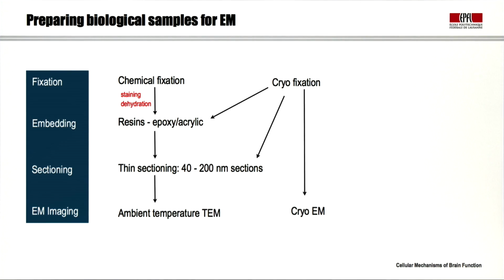Or if we're actually able to fix a very, very thin sample, for example, a layer of water containing very small particles, we can directly image a cryofix sample in a cryo-TEM. However, the cryofixation and cryo-imaging techniques are not something I'll be discussing in this video.